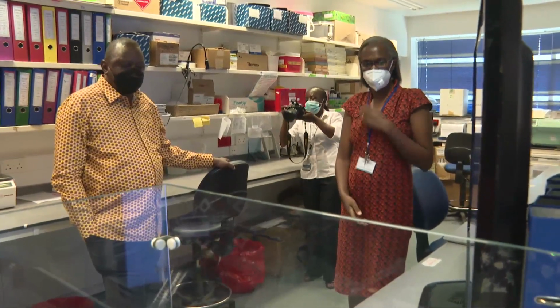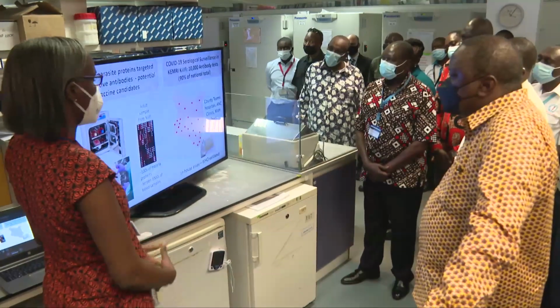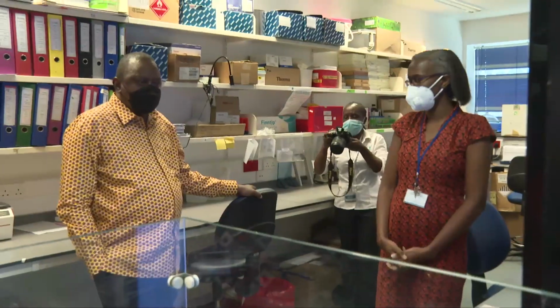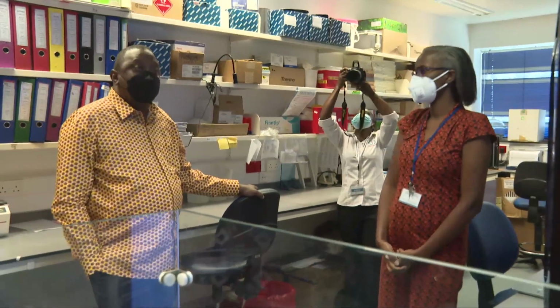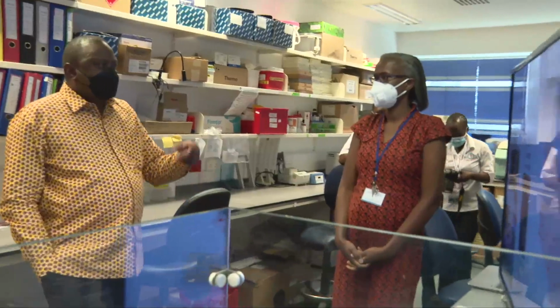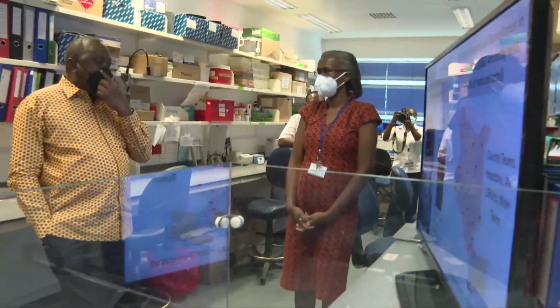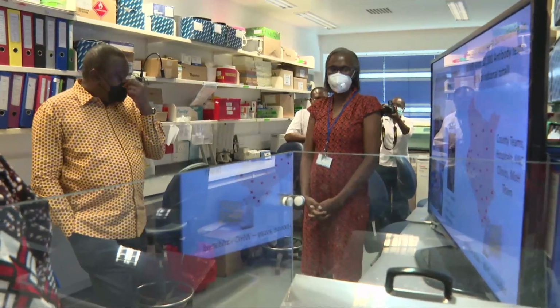And for malaria, we've been able to do this, and we've developed an in-house platform where we validate the WHO panel that was available. So now you're also able to do the genomics. Yes, and so this work nicely leads on to my colleagues.